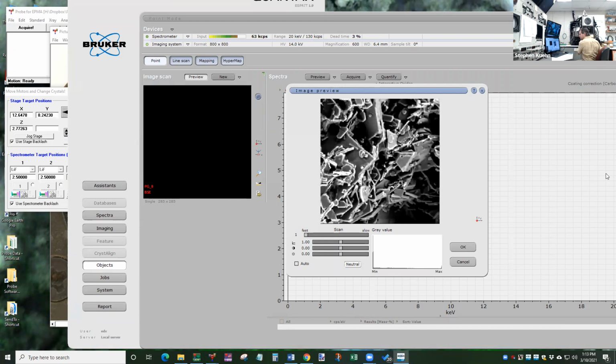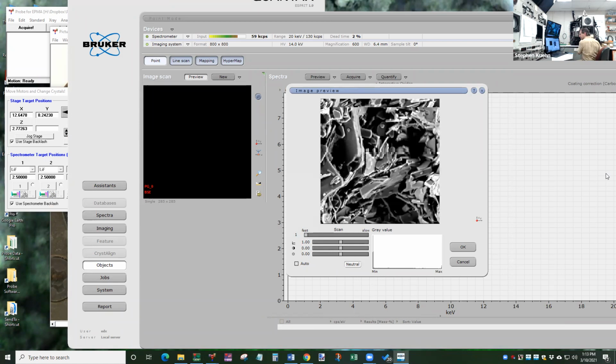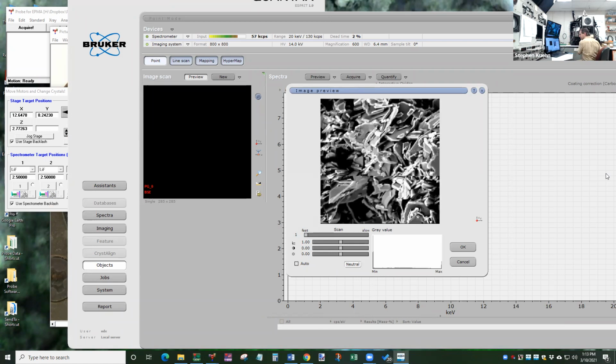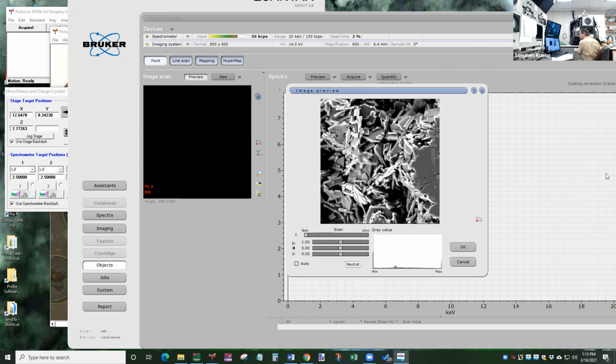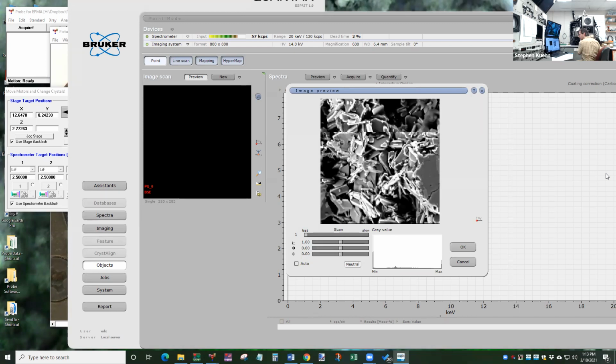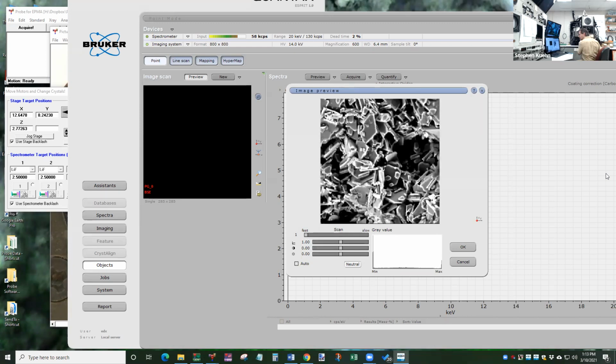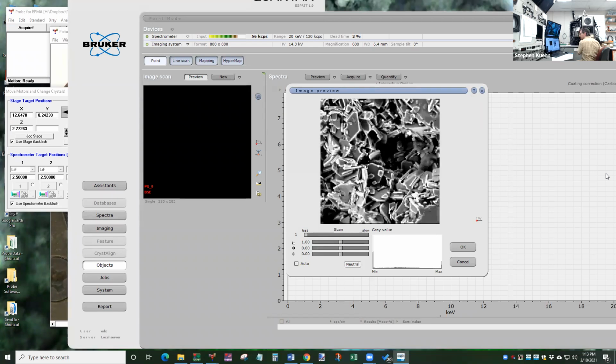All those little flat sides and rectangular shapes. Yeah, those are all tiny little crystals on the surface. Lots and lots of them. That's kind of cool. I've never actually looked in one of these holes this closely before. Usually I'm just going and trying to find other stuff. But yeah, it's just covered with tiny little crystals in there.